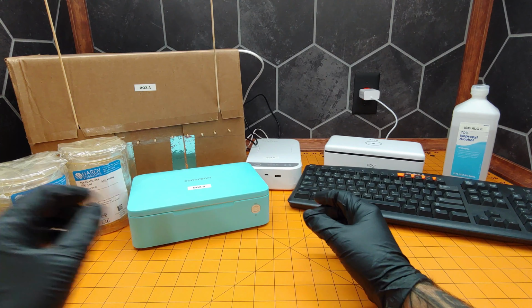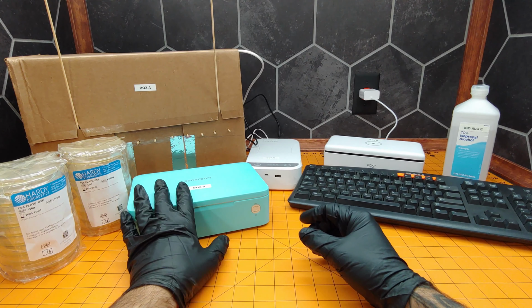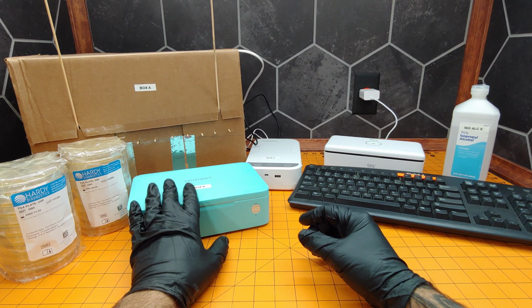Today we're going to do an experiment to find out which of these sterilizing solutions works best. Our experiment involves collecting bacterial samples off of the keyboard and using these TSA plates and our incubator to grow cultures. Our bacterial samples will be done before and after sterilization through each of these boxes.